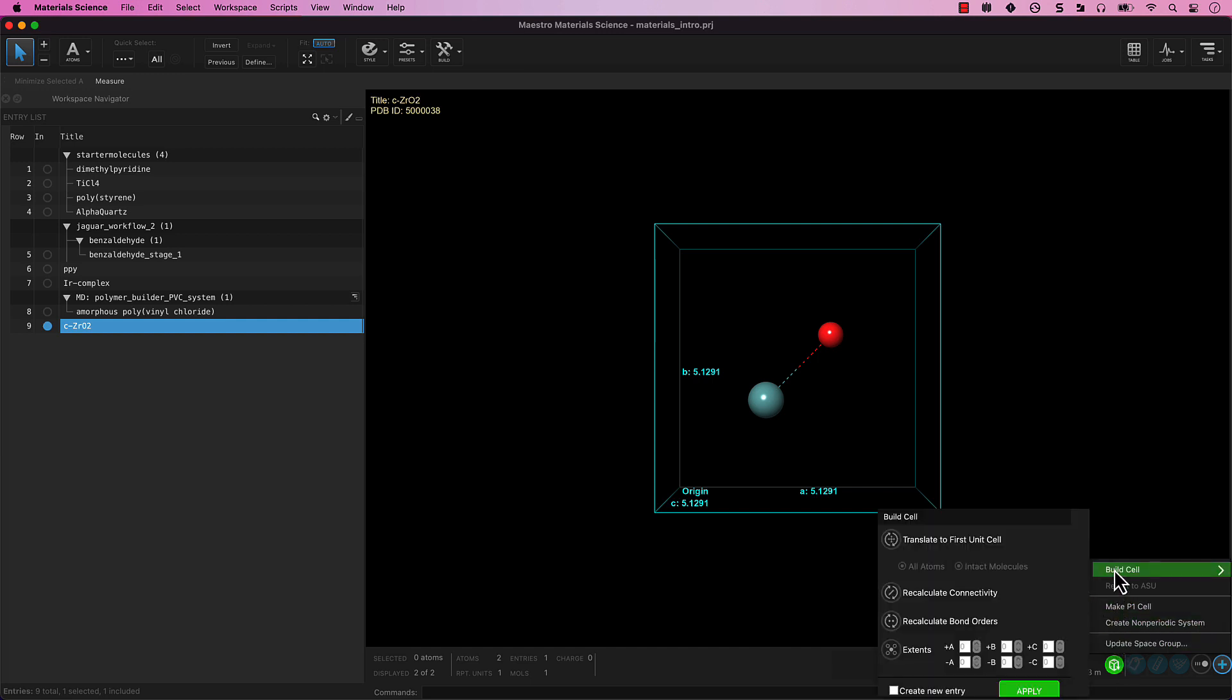Select Translate to First Unit Cell. Recalculate Connectivity. Recalculate Bond Order and set the extents to one in every direction.